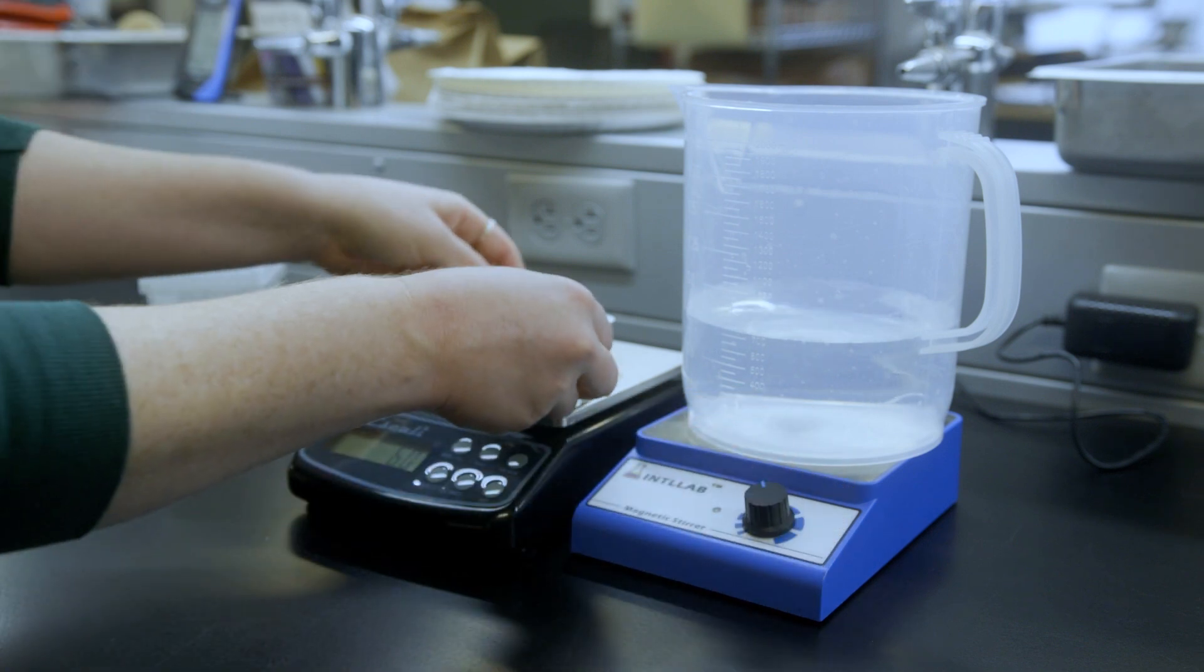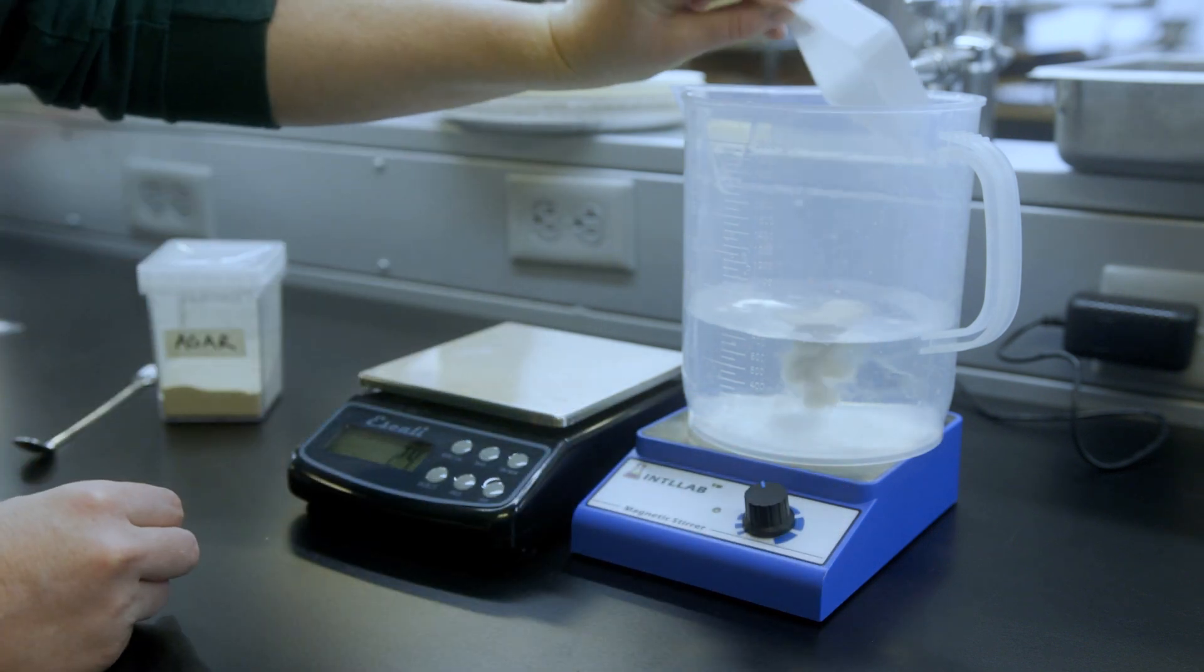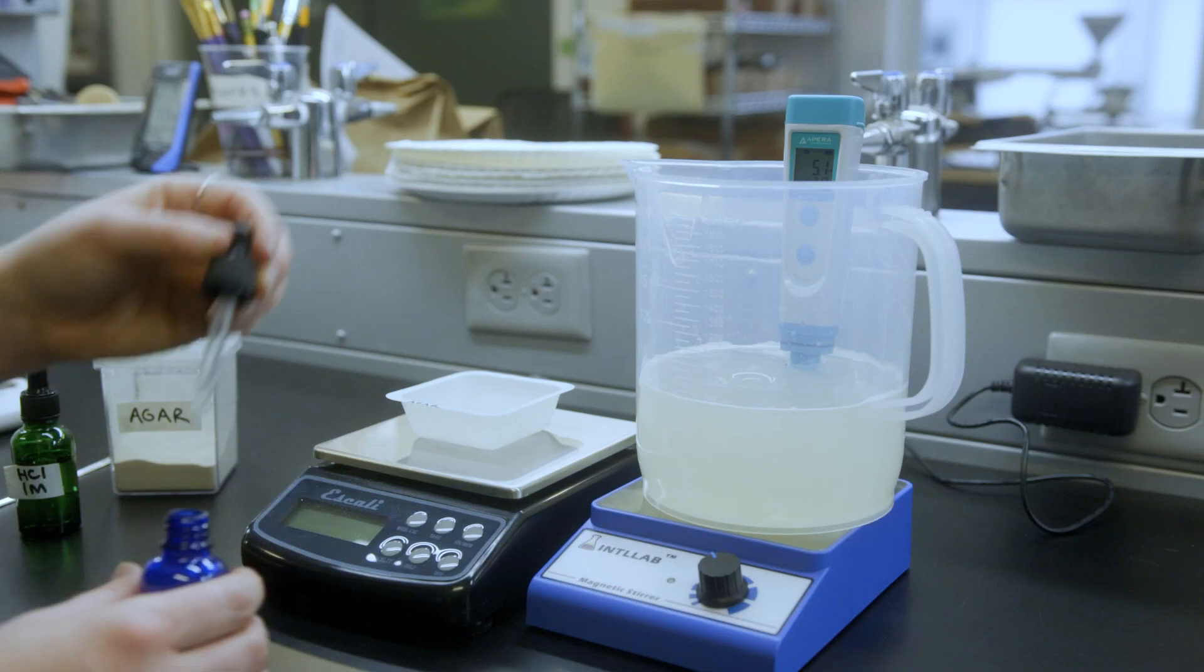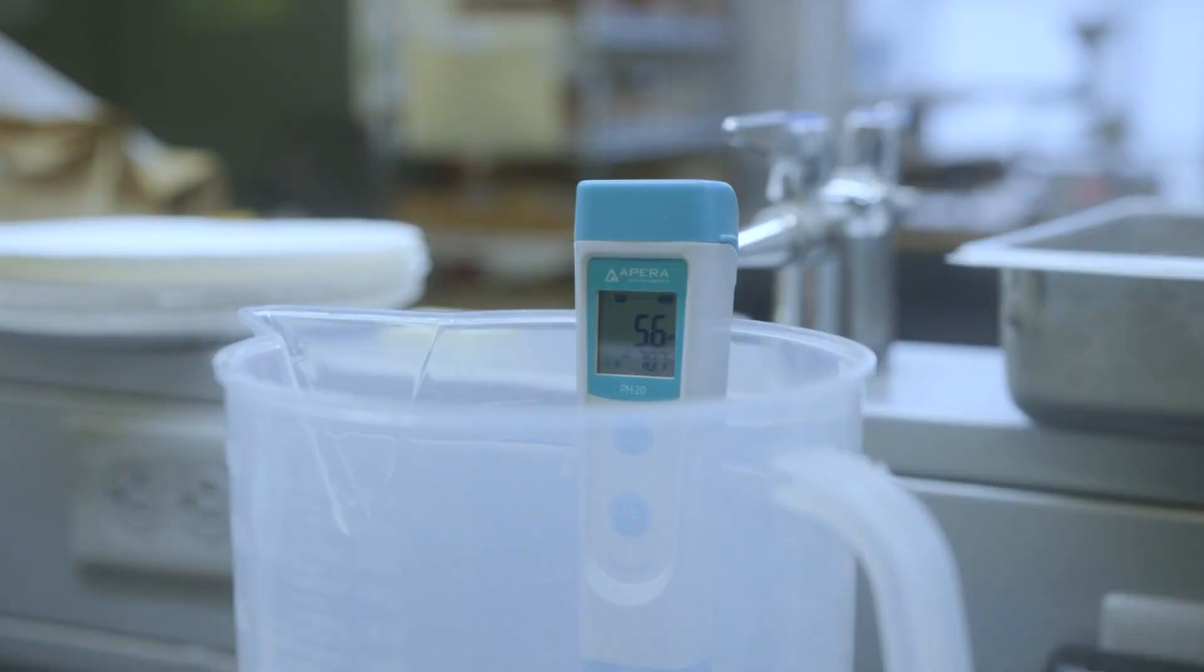The appropriate amount of agar is then added to water on a stir plate for the concentration needed. PPM is added and then pH is adjusted between 5.6 and 5.8.